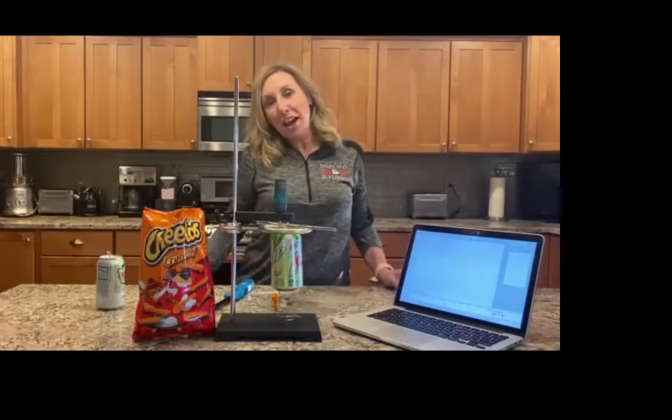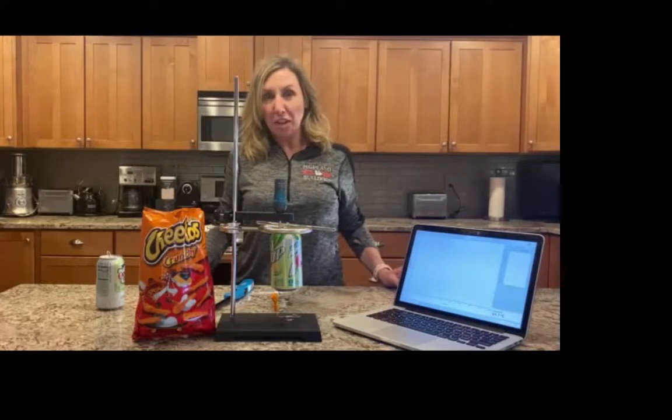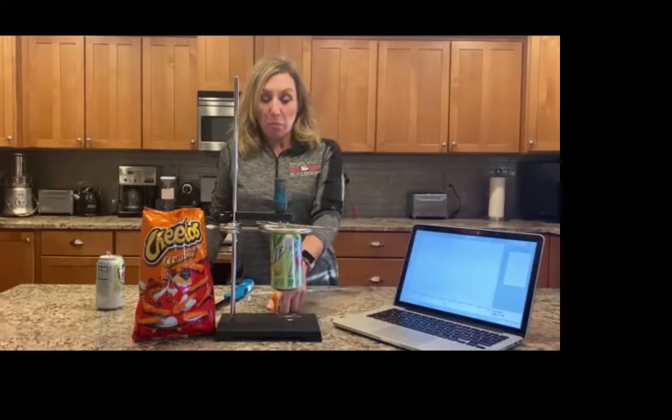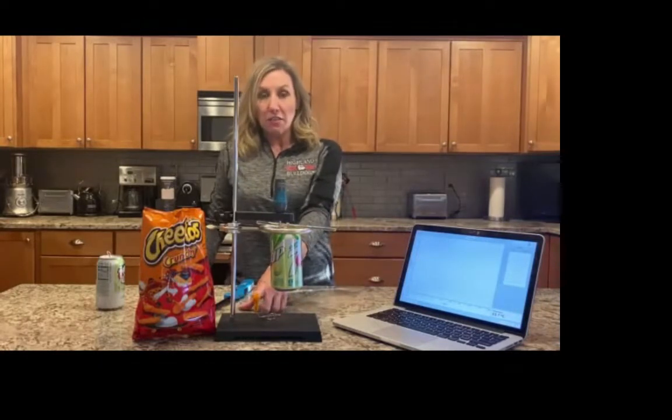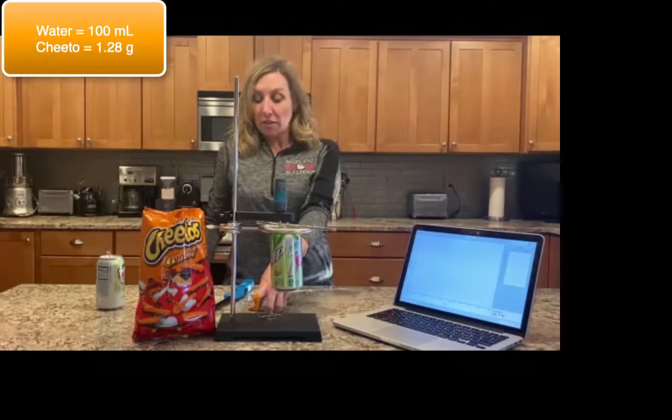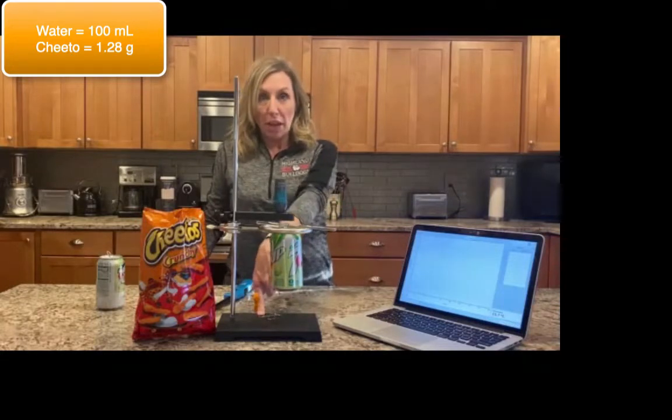Today we're going to do a lab where we measure how many calories are in a Cheeto by burning the Cheeto. So what we have here is a Cheeto. We're going to do two trials. The initial weight of this one is 1.28 grams.